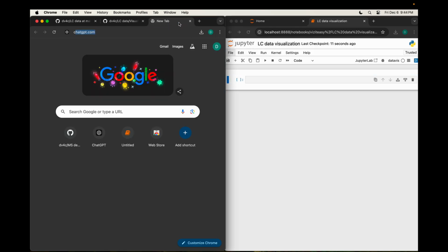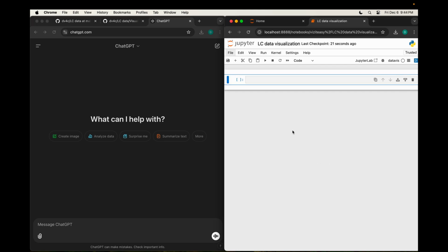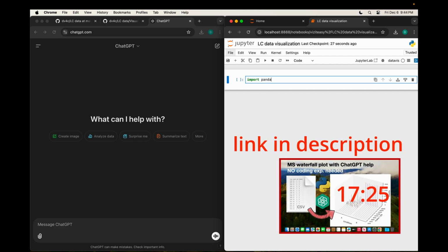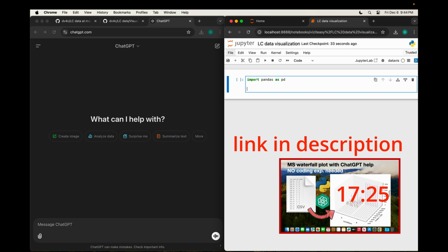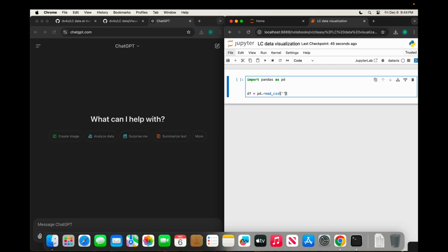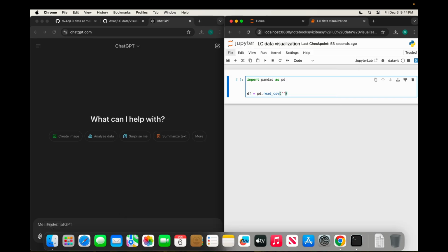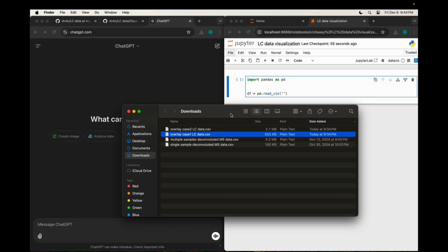And we'll open our favorite AI tool, in this case, ChatGPT. We covered how you can examine CSV files in Python in one of our earlier sessions. If you haven't checked it out, make sure you check it out here. But with that, I'll just skip that part and dive into the CSV file format.